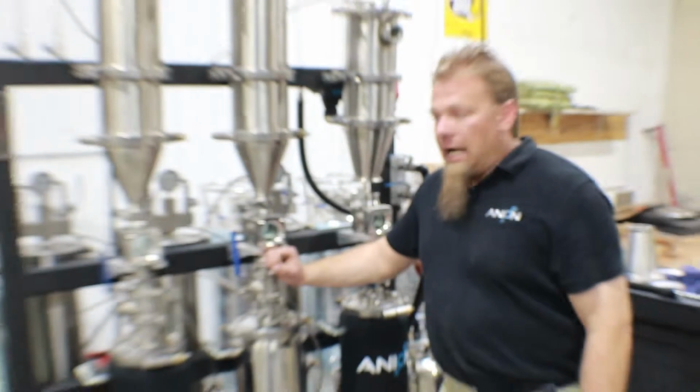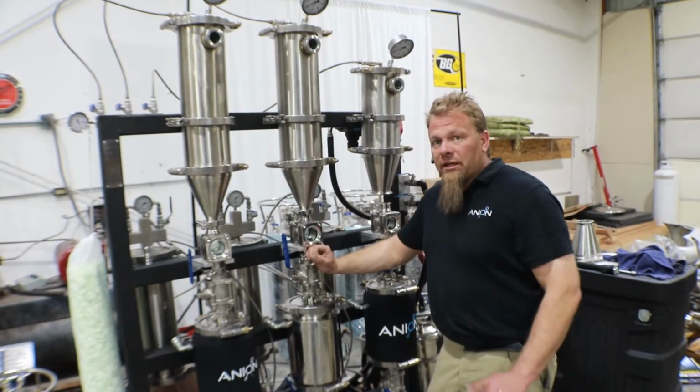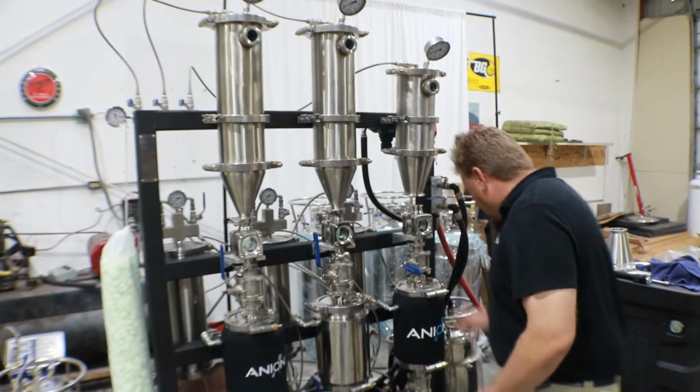You've got to shake it and you can see just ever so slightly the tiniest little film layer down at the bottom. The Welch pump over here is completely bone dry. So the Welch pump did actually finish first, so it is a faster pump. It is most notably so much quieter than the Goliath pump.